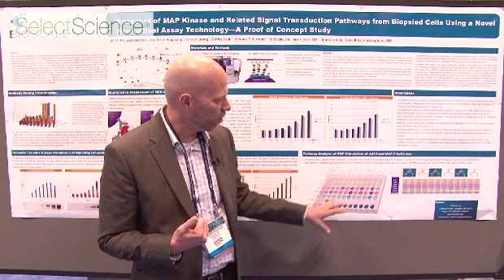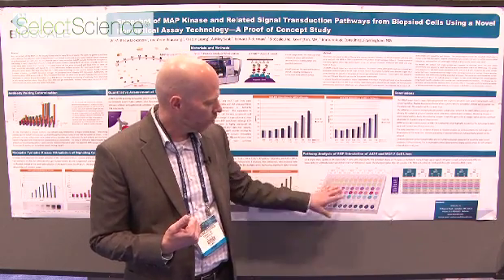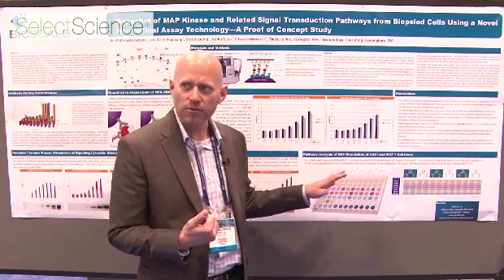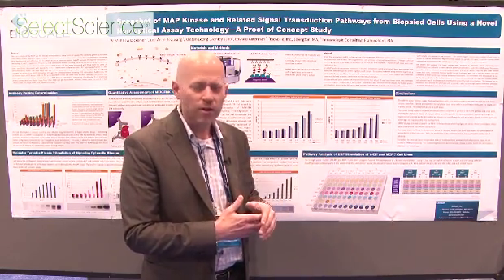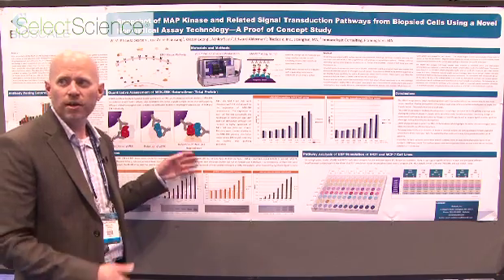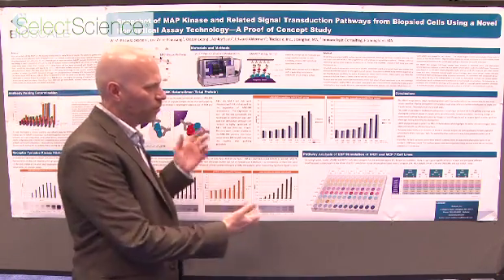So with single drug treatment with multiple cell lines under multiple lysate conditions, we're able to, in a single plate, look at 4 different pathways very easily with the technology, as well as look at interactions between kinases in the same assay platform. So that's pretty much the poster format.